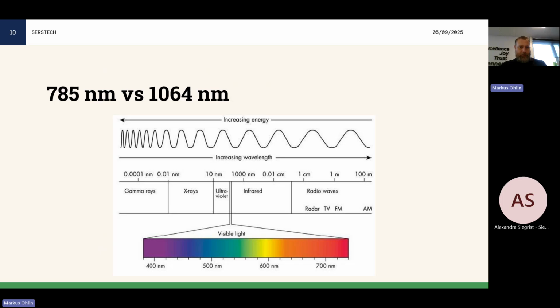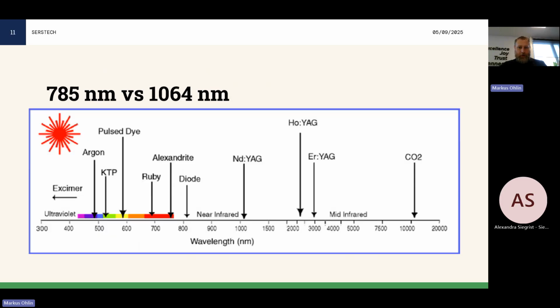So, considering these different wavelengths, again, you cannot choose just any wavelength when you're designing a Raman spectrometer, relying on a one wavelength laser source. You have to choose something that exists or is already developed. So there are a few different wavelengths to choose from. There are other wavelengths in between. For instance, 830 is one that is in between, but there are also others at lower wavelengths.